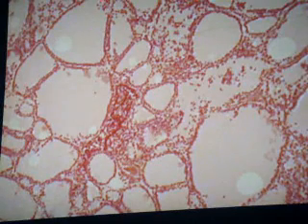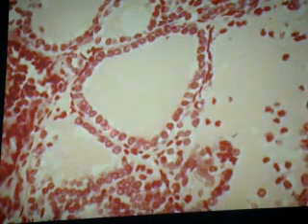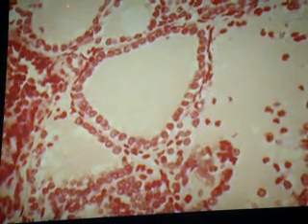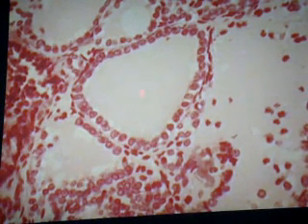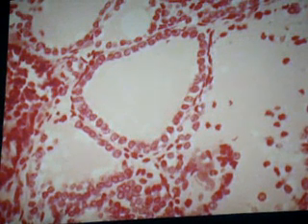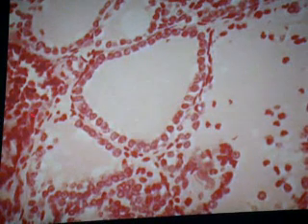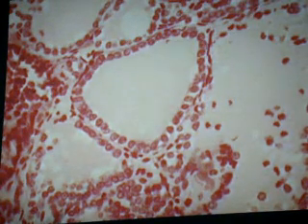So, what is this? Classify pointed tissue. Okay? So, let's look at that particular tissue under high magnification. One thyroid follicle, another thyroid follicle. One thyroid follicle adjacent to this thyroid follicle. Classify pointed tissue, be specific. Simple cuboidal. Okay, don't ever commit the mistake of writing down stratified cuboidal epithelium.